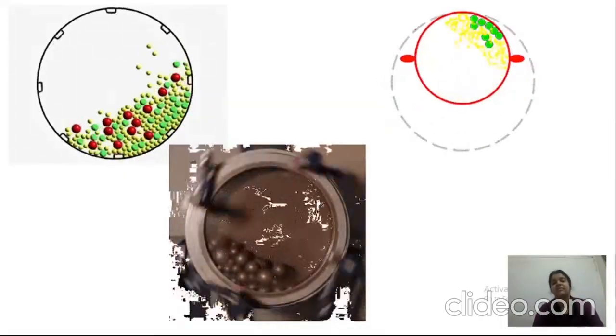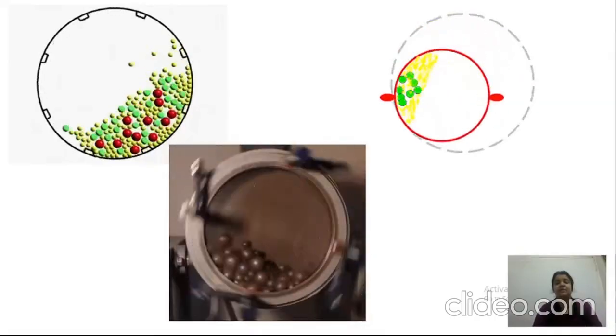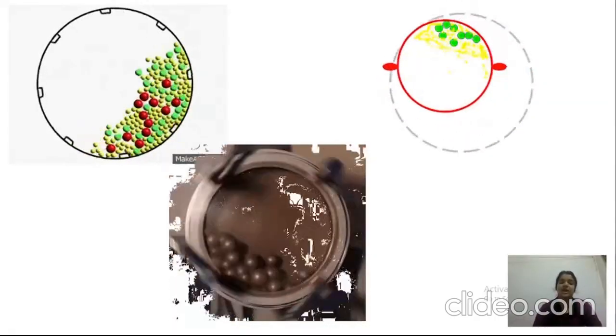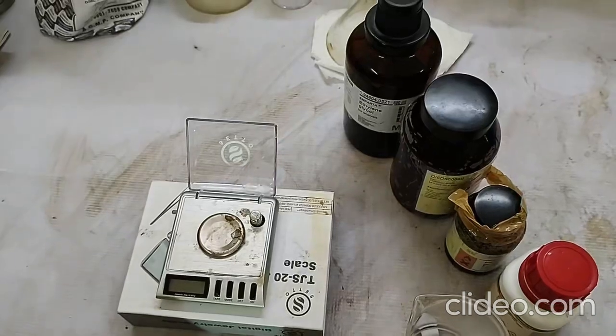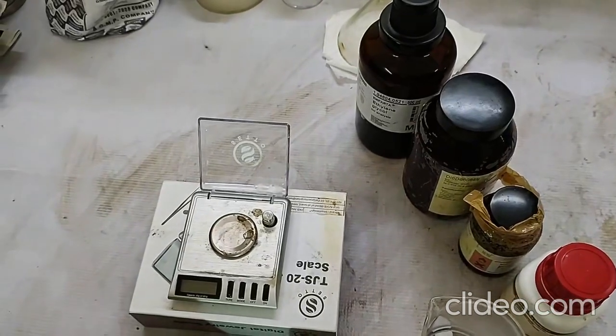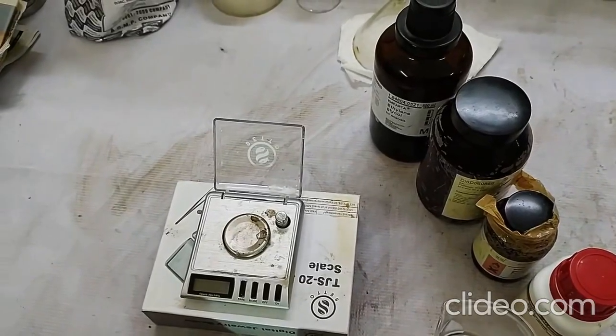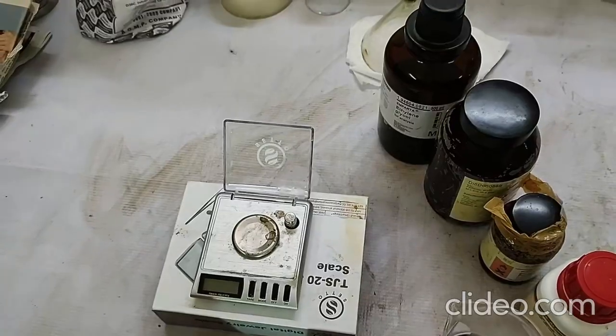Okay. Now we are discussing the other chemical methods, like the Sol-Gel method, hydrothermal method, etc. One of the sample preparation methods is the sol-gel process, and in this video we are going through this process step by step. So at first we are trying to prepare BiFeO3 nanocomposite.